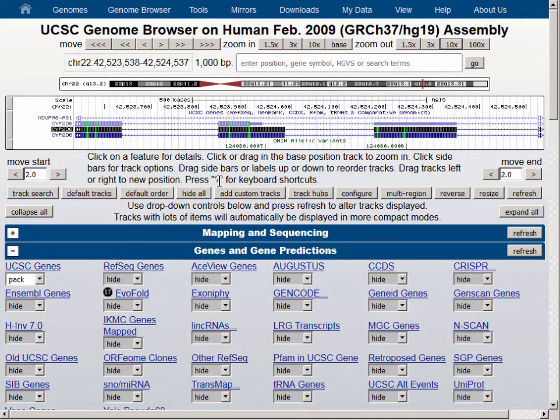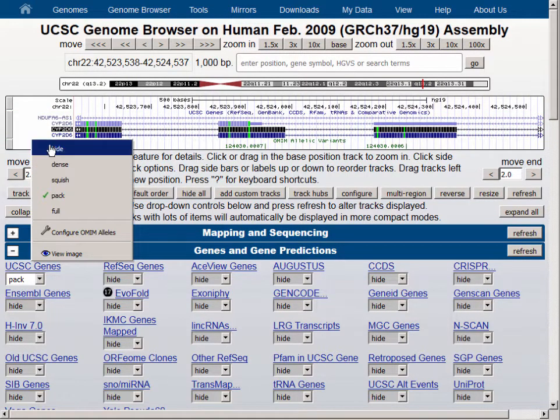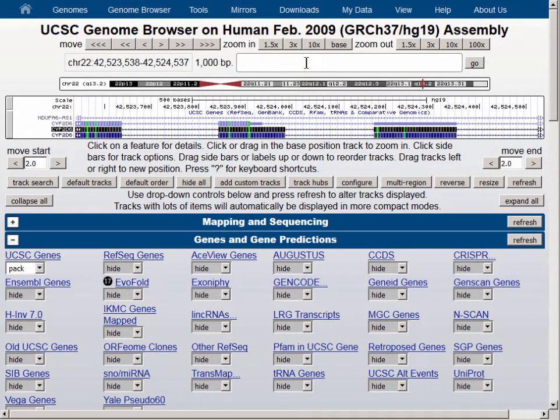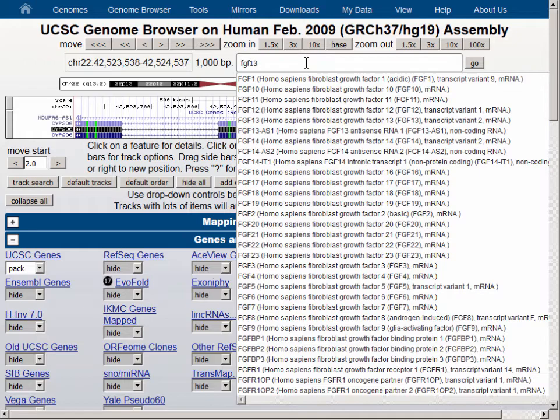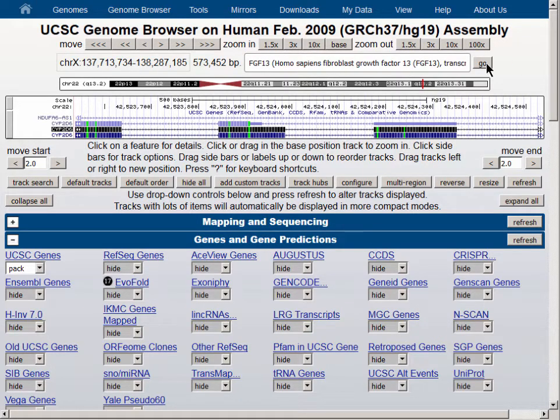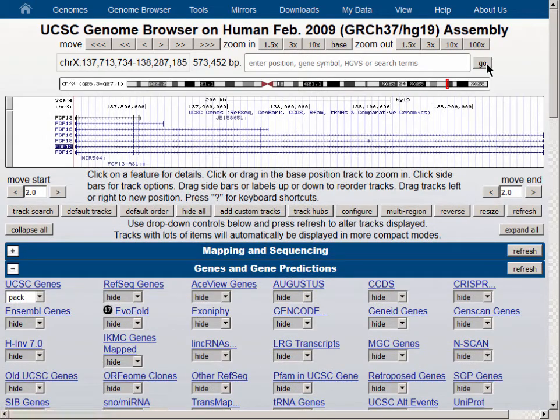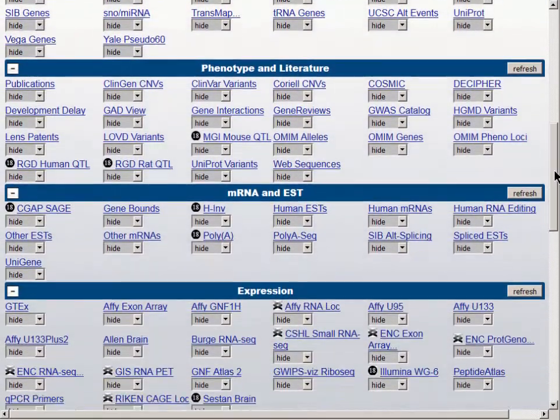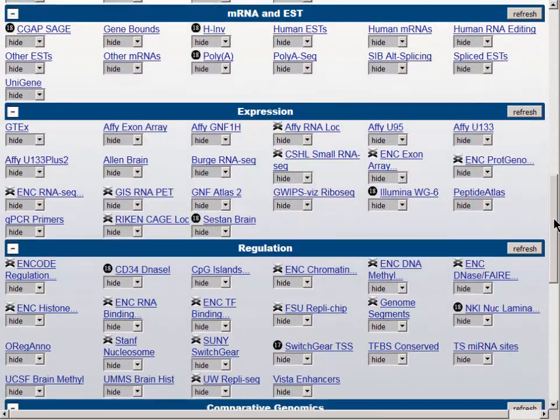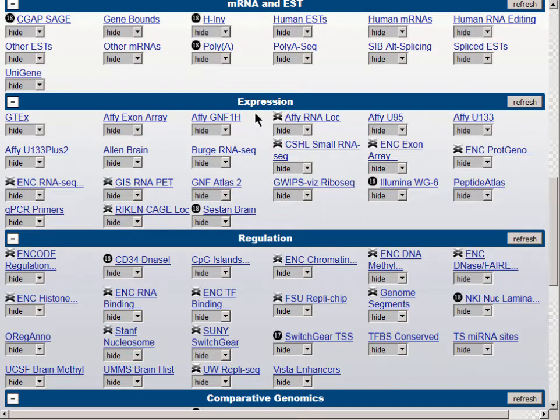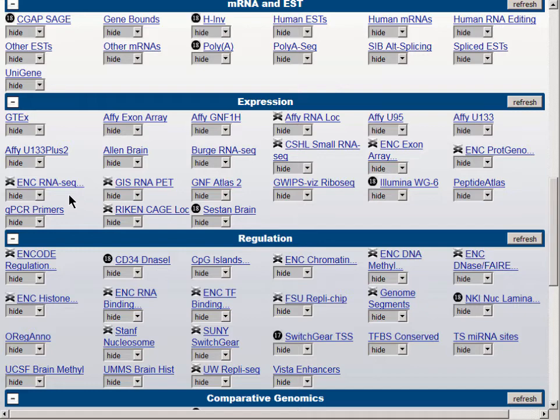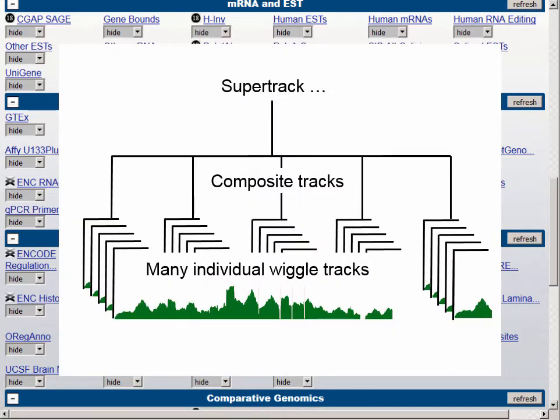Let's turn off the allelic variants track and move on to discuss another type of track known as a wiggle track. We'll navigate over to the FGF13 gene and turn on an appropriate track. A wiggle track gives us a second dimension in the data. A good wiggle track for this on the HG19 genome assembly is in the expression group — the ENCODE RNA-seq track. The pull-down menu here has only two options, hide and show, in part because it's a track type we call a super track, indicated by an ellipsis on the short label of the track, meaning it's a package of multiple composite tracks.